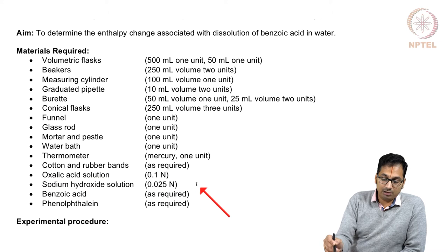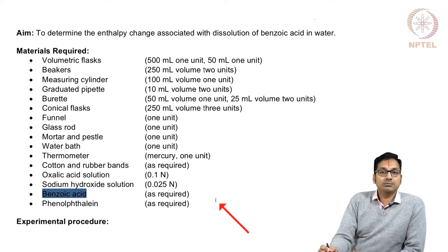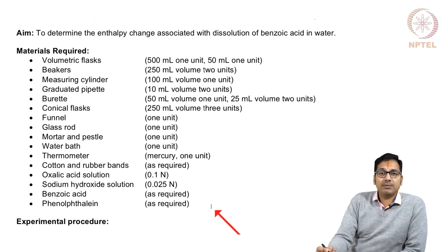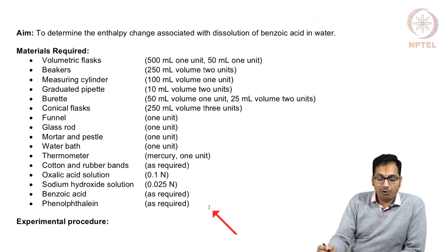at a certain normality that you know, but of course this has to be standardized with oxalic acid, then the benzoic acid so as to perform the experiment, and phenolphthalein dye which will help you do the acid base titration to visualize the endpoint.